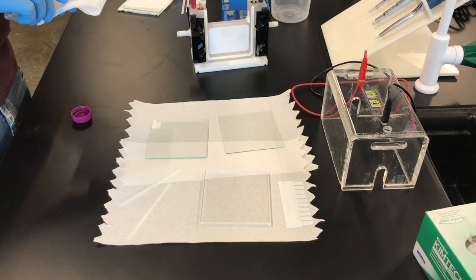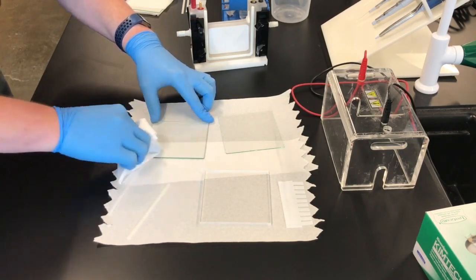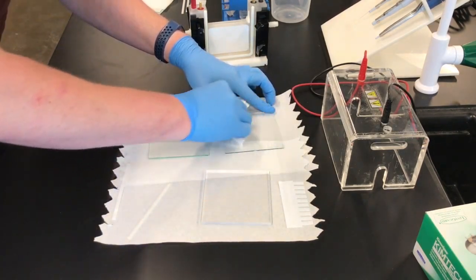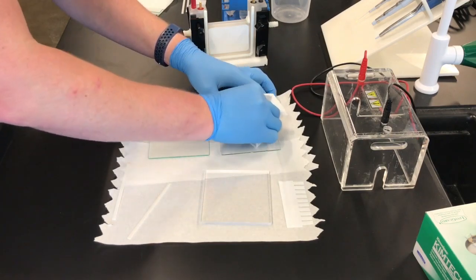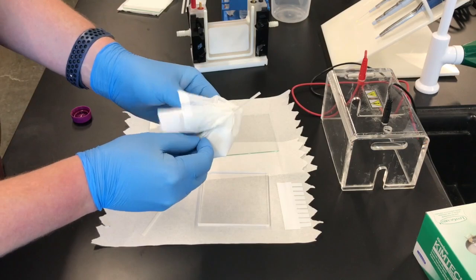We're going to use a little bit of ethanol to clean off the glass plates. This is just to get rid of any dust or residue that might be on the plates. Clean one side of each of them, and you can also use the chem wipe to wipe down the spacers and the comb as well.